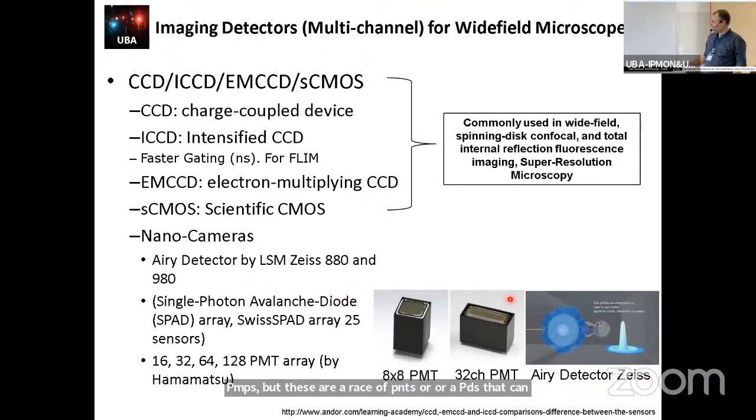One case is the Airyscan detector in the Zeiss microscope that can basically be used as a spatial camera, and in the LFD they developed a technique to study fluctuation within this detector, and then you can apply many of the tools that we will learn.